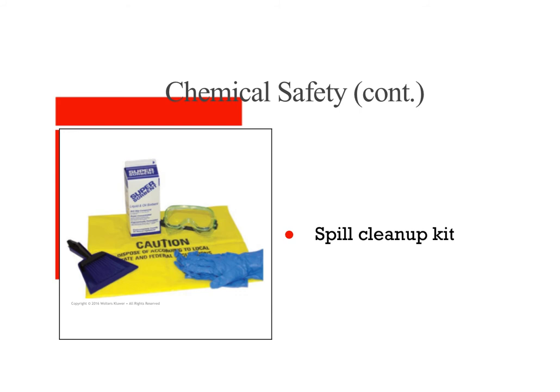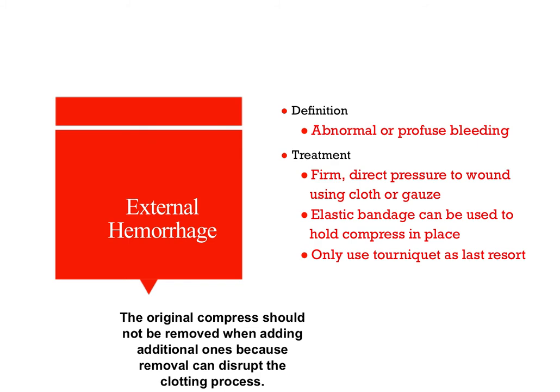All right, this is an example of a chemical spill kit. So whatever chemical was spilled, you would go look in your safety manual. It would tell you what kit to use, how to clean it up, and then you would use it exactly as directed, okay? We don't want to show up to the ER for a preventable mistake, okay?